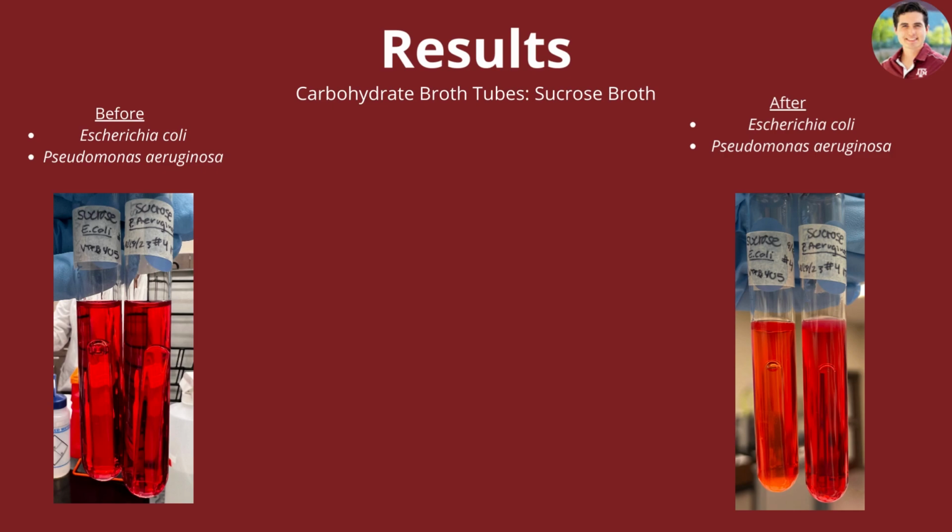does have the capability to ferment sucrose, which results in the production of acid. This may be due to some interference, perhaps, or a weak, low count of microorganisms in the tube. But it is supposed to turn yellow and be a positive carbohydrate reaction.